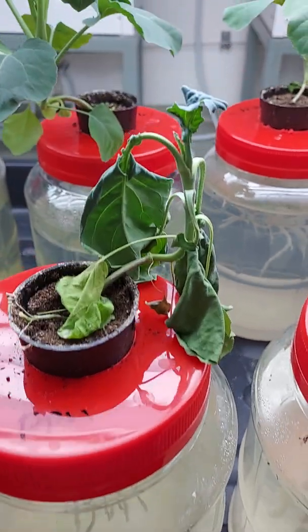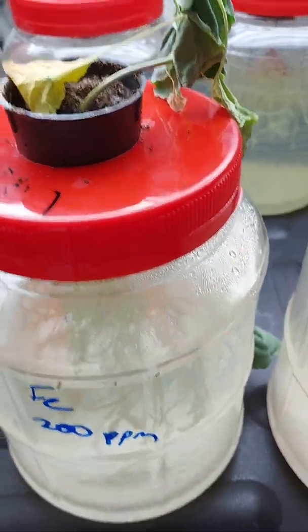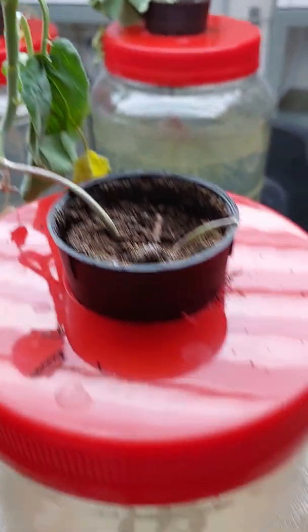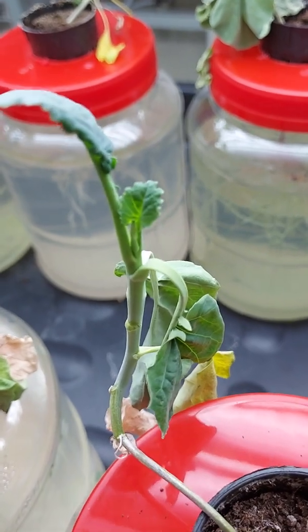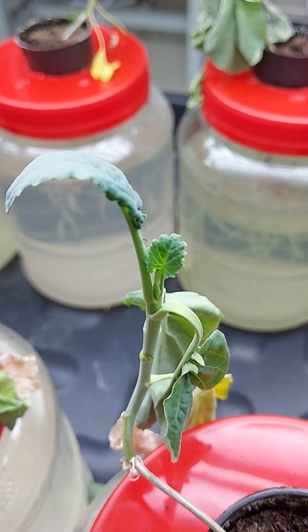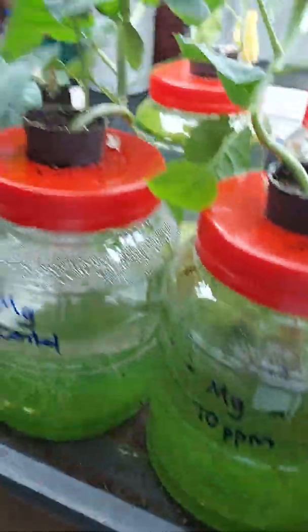100 ppm results in a deformation of the leaves, and you can see the deformities. Again, at 200 ppm, you see extreme deformation of the leaves, and at 500 ppm, of course, the plant appears to be almost wilted, with only the apical part visible here. Okay, let's look at what happens in the case of magnesium. So I'm going to move up to the next shelf, which is magnesium.